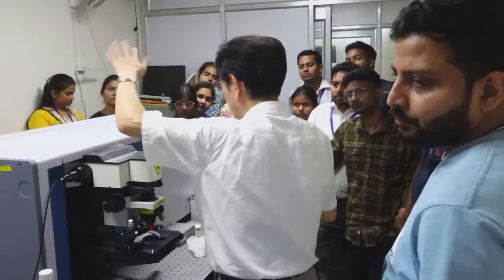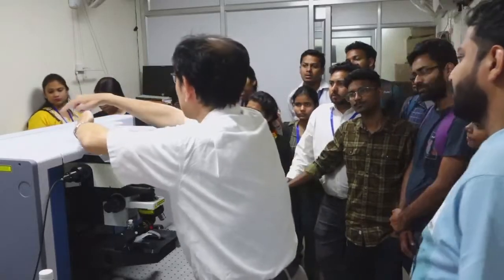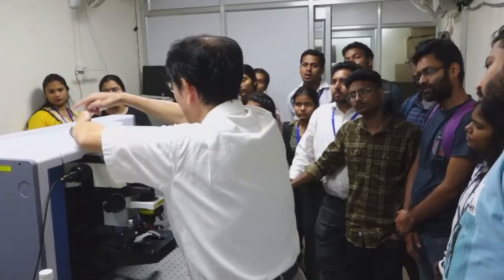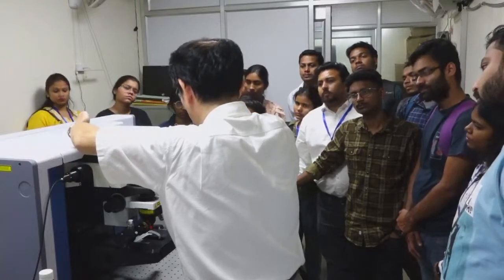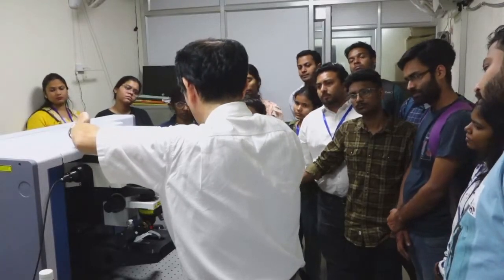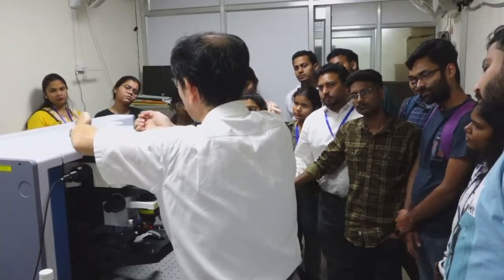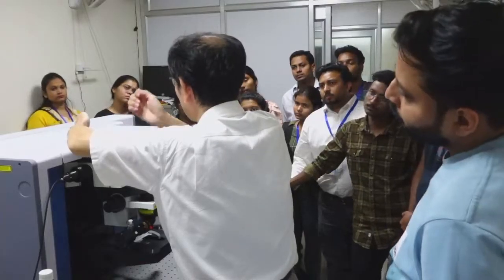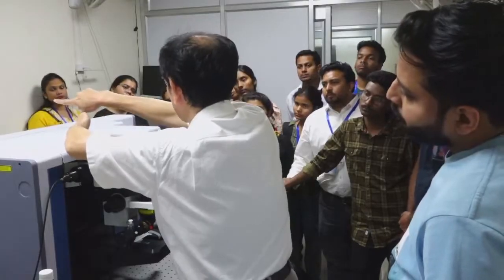Then let's put this element here. 633 comes, and this is transparent for 633. So it passes through and focuses onto the sample. Then the backscattering component, including the Raman signal, comes here. For 633, it is transparent, so the laser line goes straight.